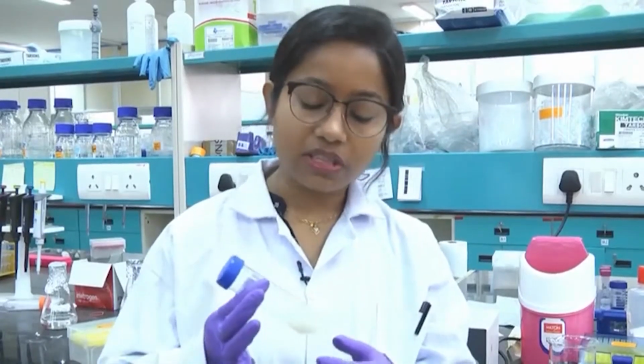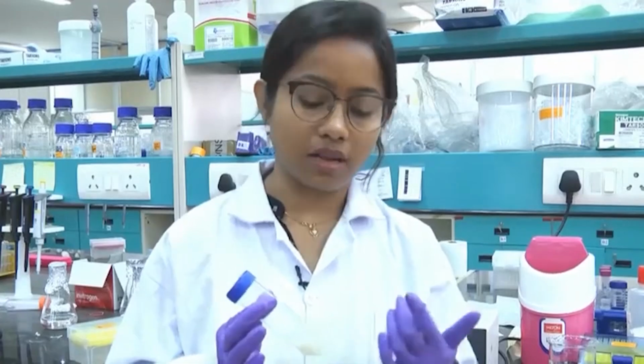Depending on your protein, you need to check the pH range, because you should not go close to the pI of a particular protein. At its pI the protein will be neutral and it might get precipitated out or coagulate. So for that you need to check the pH. In our case our protein is happy at pH 8.2 because my protein's pI is around 11 or more, so it is not close to its pI.